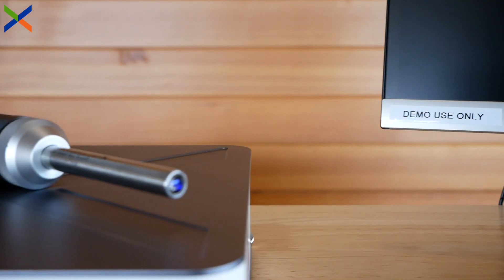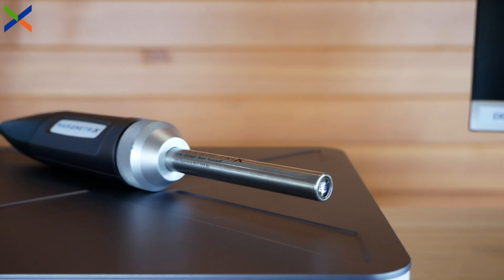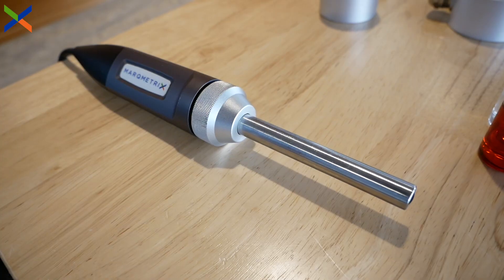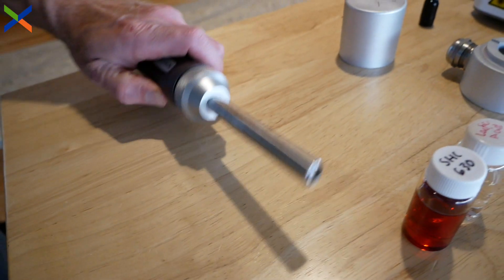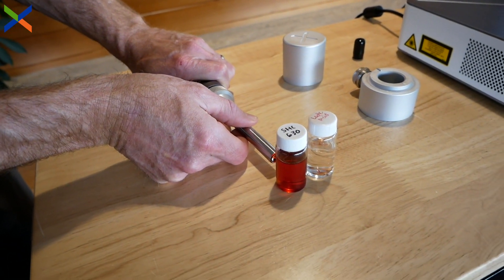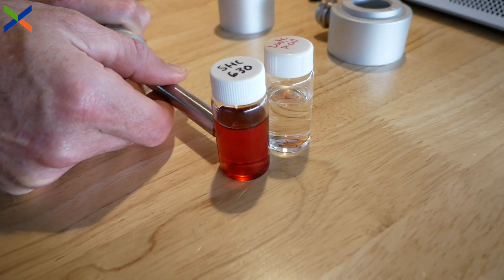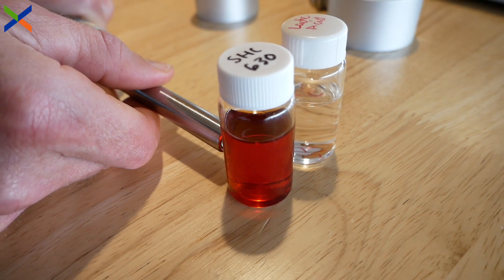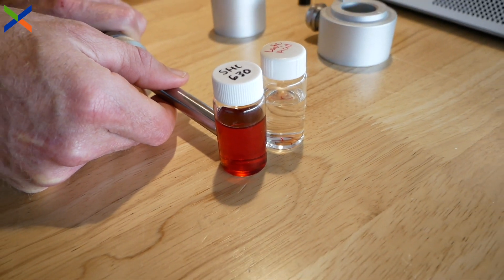Let's start by going over the specs and applications of Proximal Ball Probe. It features a compact design with an overall length of 4 inches or 101mm. With a working distance of 8mm and a beam spot size of less than 500 micrometers, Proximal Ball Probe delivers an extremely high Raman signal throughput, even when the sample is behind windows or semi-opaque walls. Its small beam spot size and relatively short working distance are perfect for measurements through vials, glass bottles, or windows.